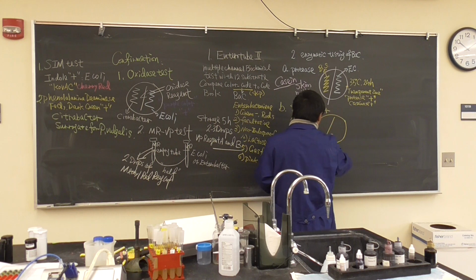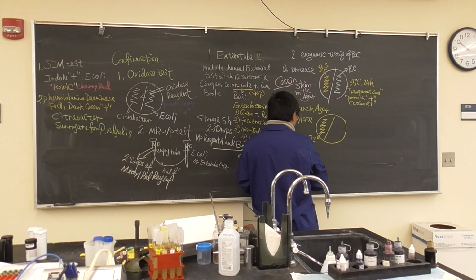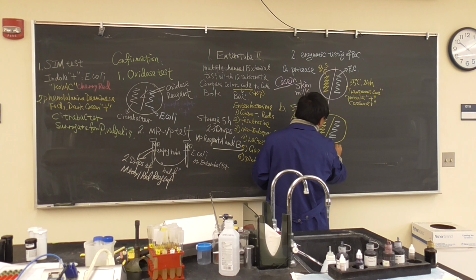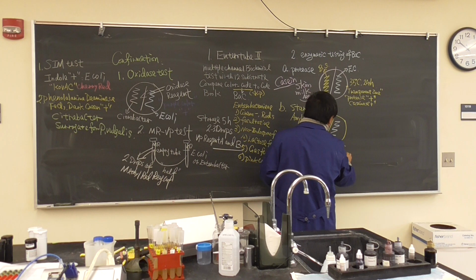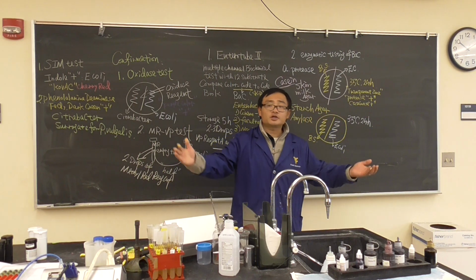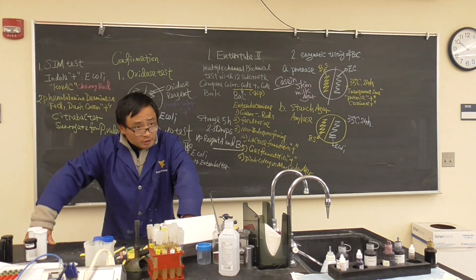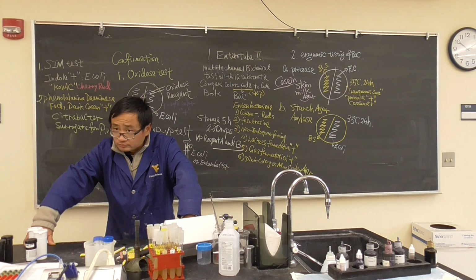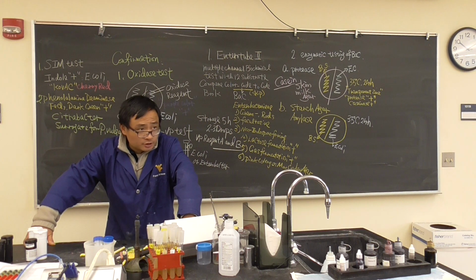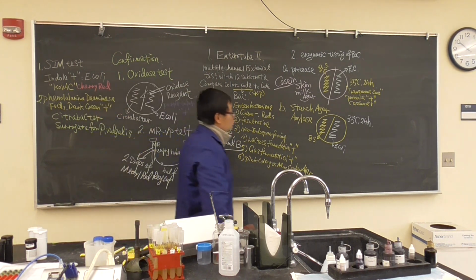We're using a starch agar, split into two. On the left side, we're going to do the same thing, add Bacillus subtilis. On the right side, we're going to add E. coli. And then we will be doing 35 degrees Celsius, 24-hour incubation. Now the question is for you. How do you know the starch is used? How do you know the starch is not used? Some people say you see a transparent zone. No. How do we do it? How do we test the starch?